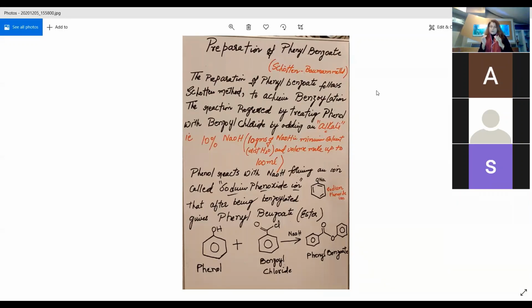So this is how you are going to prepare. Whenever an organic reaction starts, you need a lot of reagents. If the reagents are not prepared, then you are supposed to prepare them. So what reagent did we need in this experiment particularly? We needed 10% sodium hydroxide. It is supposed to be freshly prepared. Almost every time you make a percent solution of some alkali, you have to prepare it on the spot, that is, freshly prepared, right? So this is what we have just done.